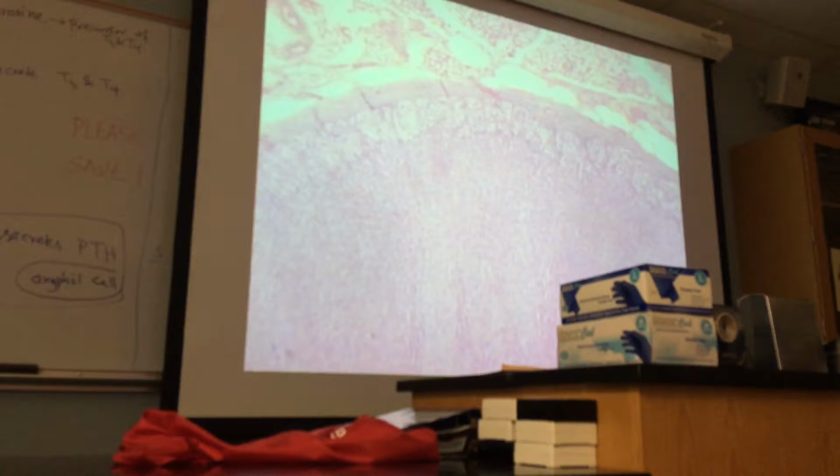And here also, you can see only the covering of the adrenal gland, but you don't see any medulla. You see only the adrenal cortex. But if I go like this, you see adrenal medulla now.